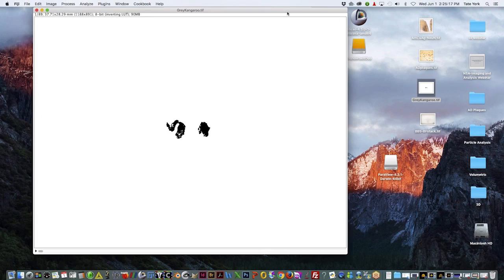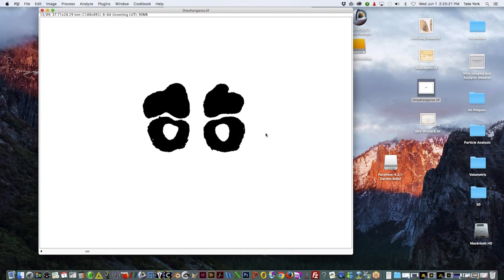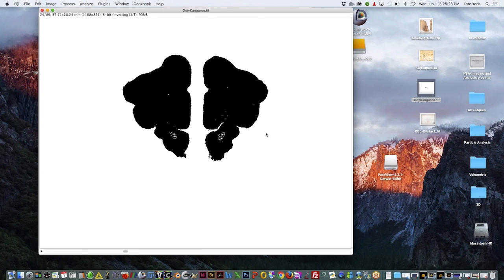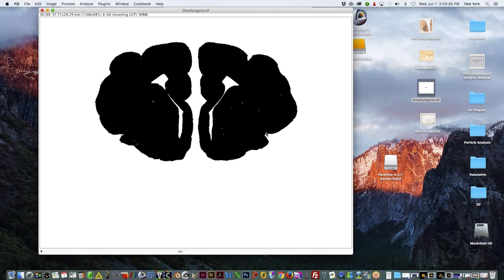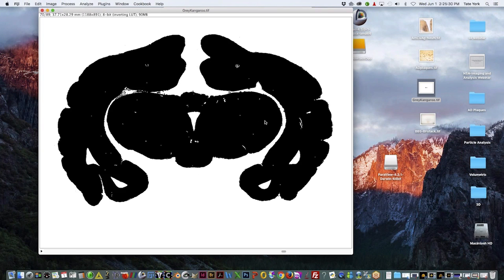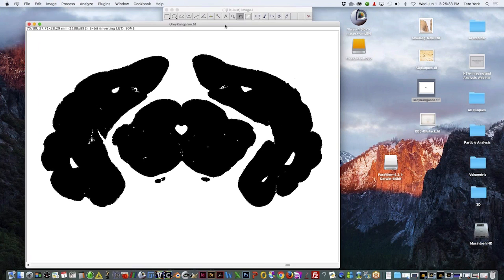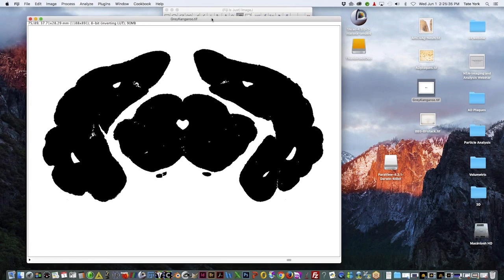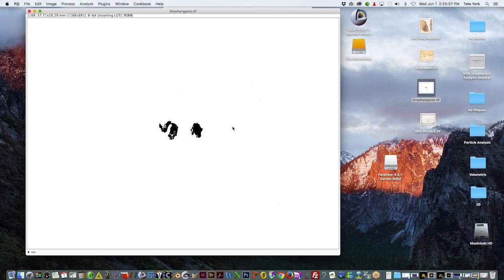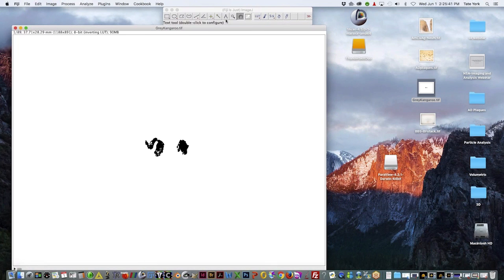And so here's your output over here. It's counting the area in every single slice of this stack. And so what we end up with is a whole brain volume of this gray kangaroo brain, which is a little over 12,000 millimeters cubed. And this can be applied to whole brain volumes, any region of interest that you may be interested in.